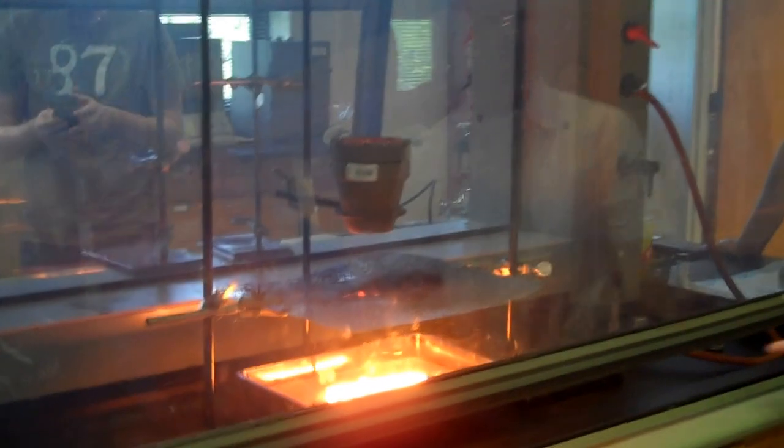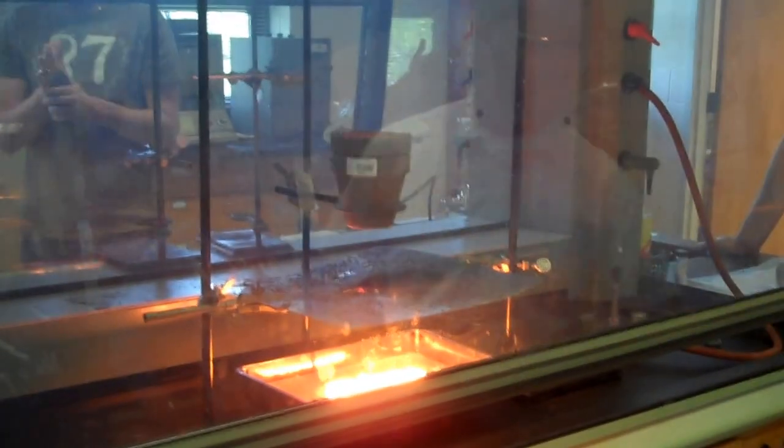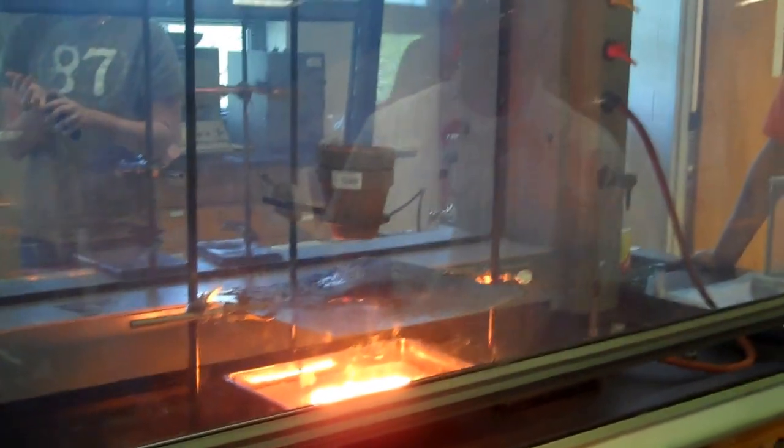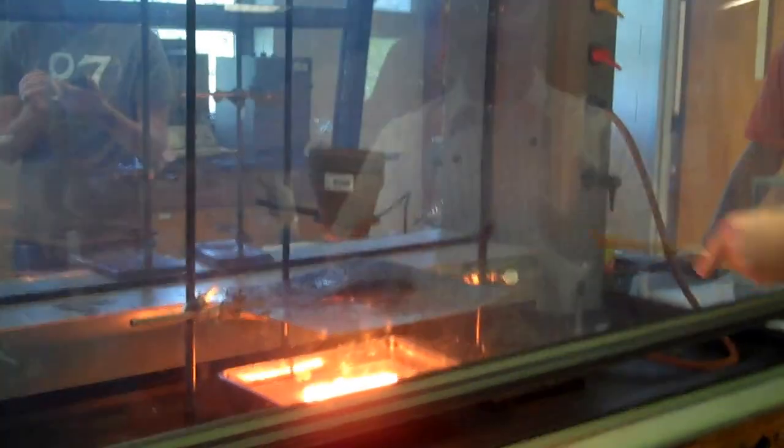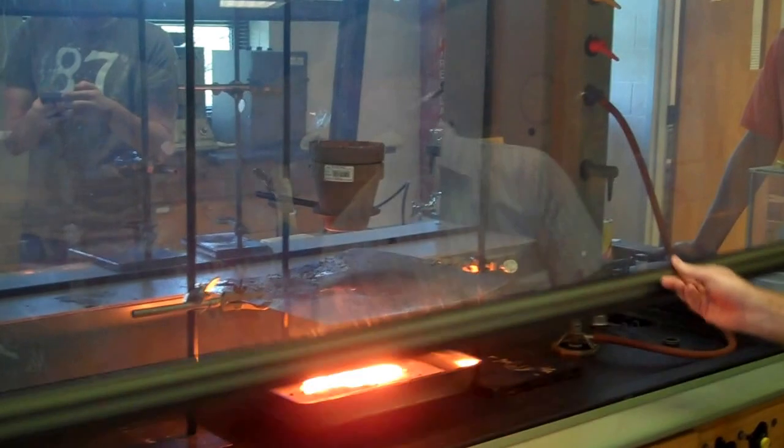This is why we wear pants in the chem lab, people. Says the person not wearing pants in the chem lab.